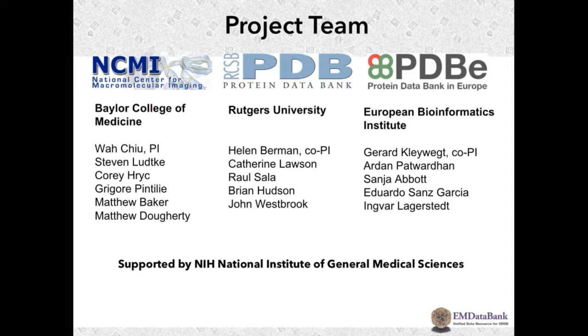Anyone? Have any of you used EMDB to download anything, view anything? I've pulled lots of maps. Lots? A handful. Do you know if they're any good? They seem to be good. The maps I've downloaded also had recommended contour levels, which was really helpful. I found that key to actually using the maps that I downloaded, to see what the builder saw.